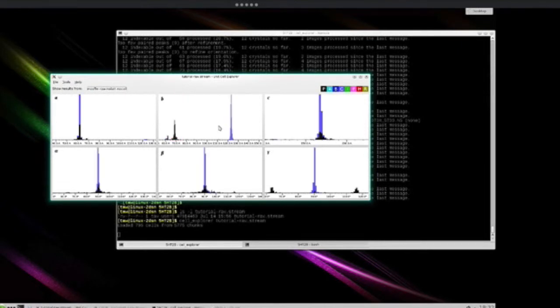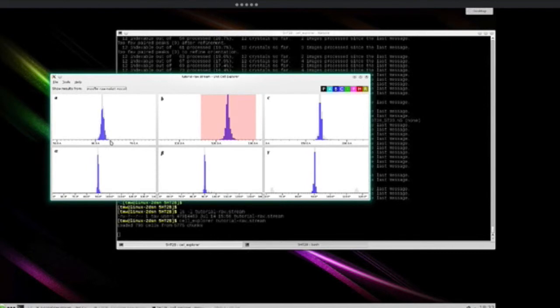So this can also happen, that you get some contamination in the liquid, the crystal suspension that you inject into the beam. And then you'll see it in here, you'll see two peaks, and you'll be able to diagnose what's going on there. So let's go back to those nice orthorhombic peaks. Let's zoom in here, set the binning, plus key. I'm going to select all of the peaks.